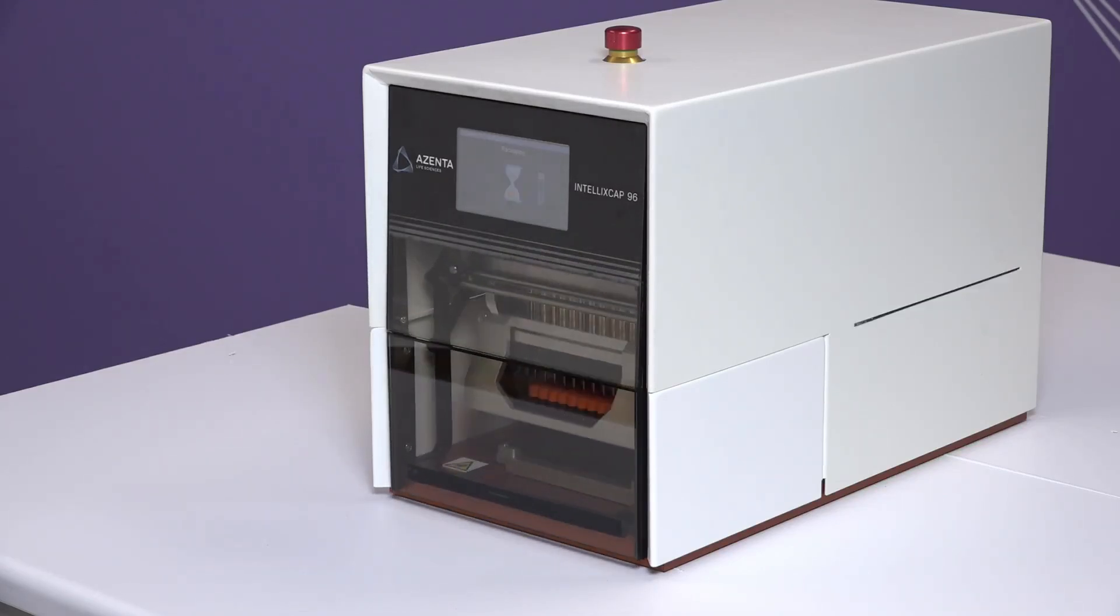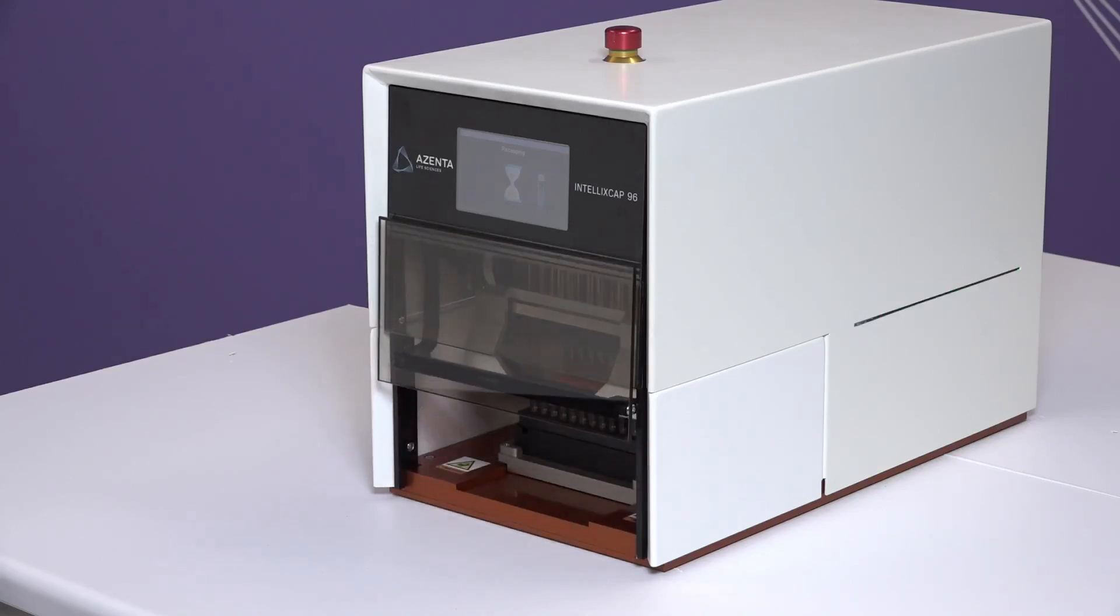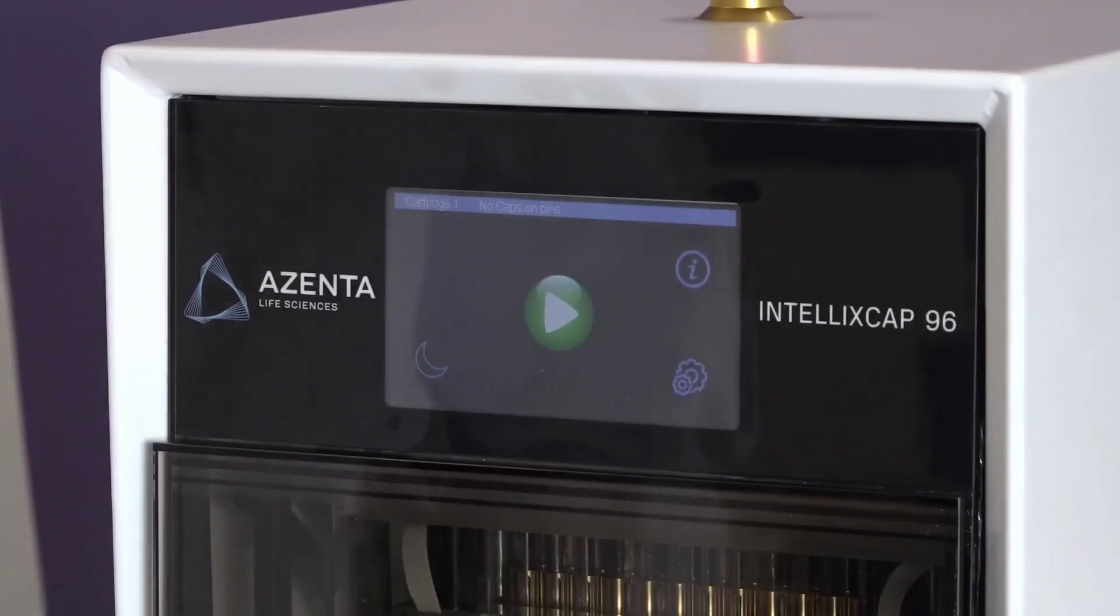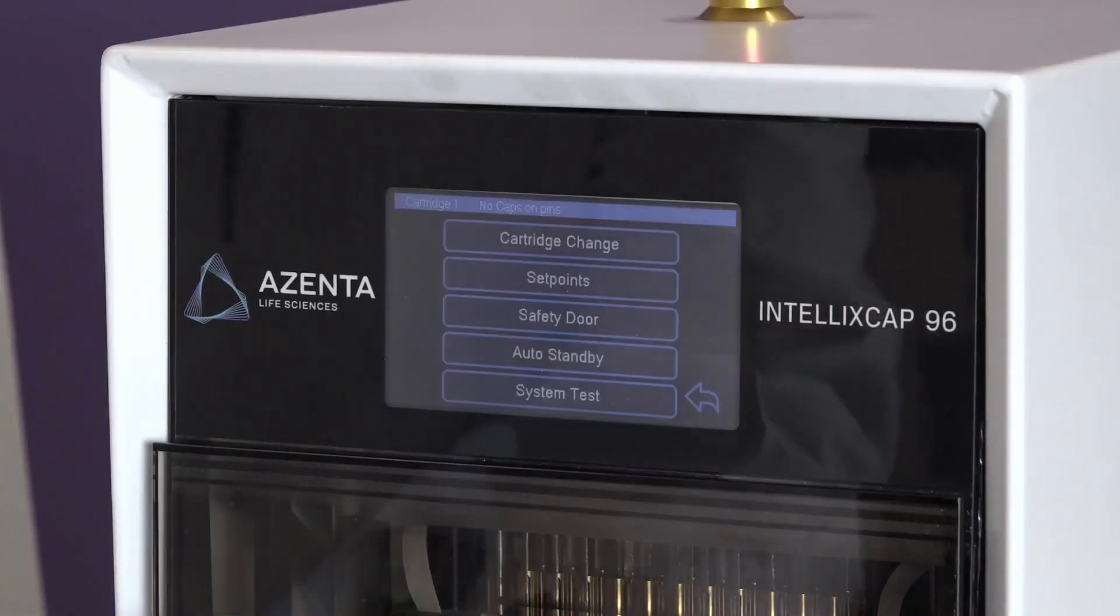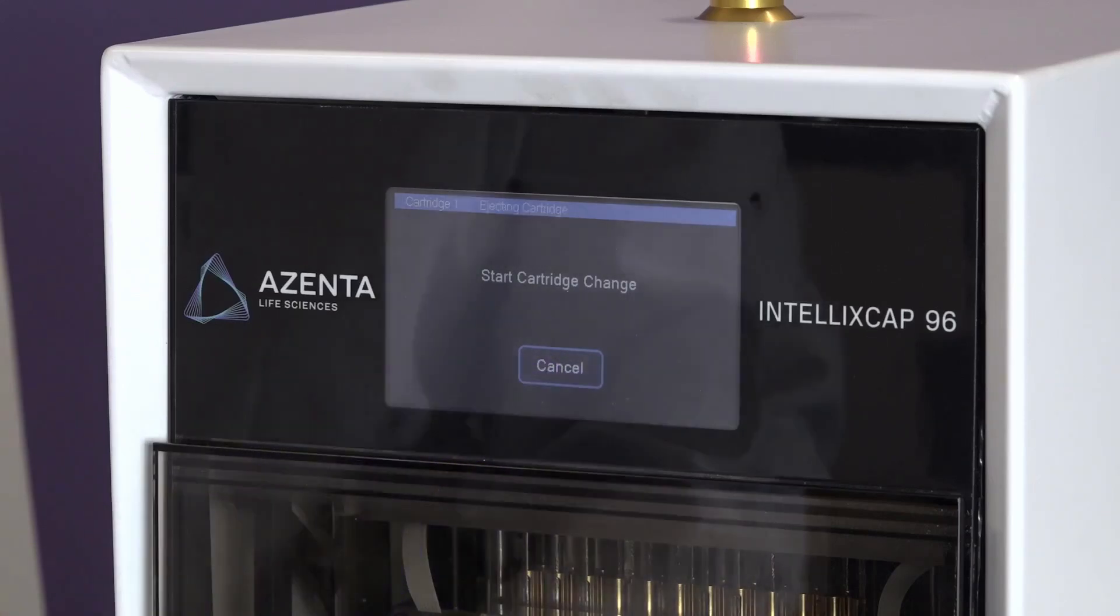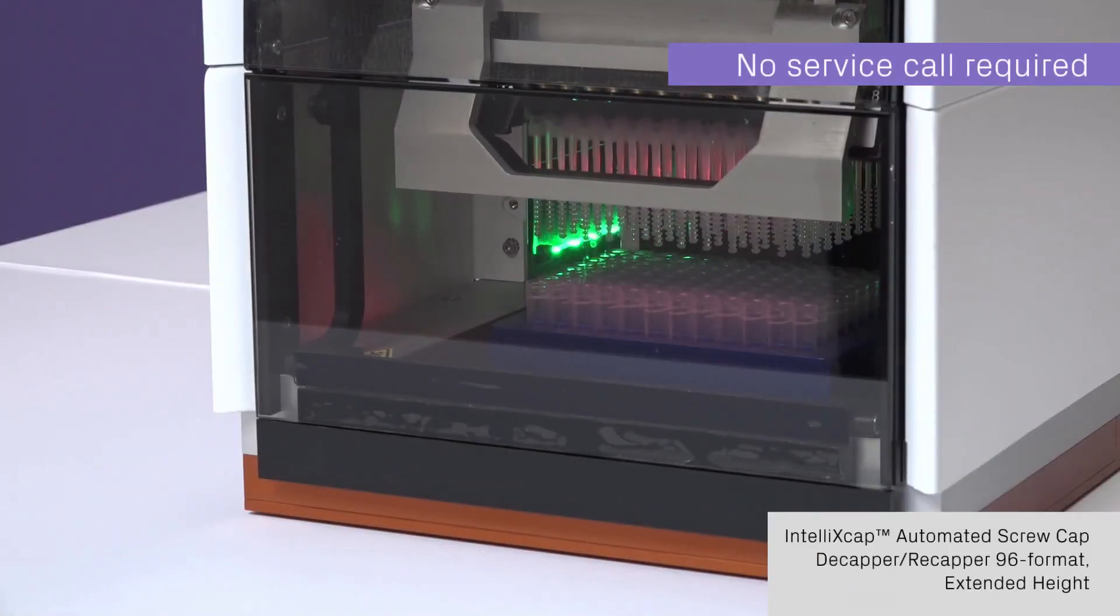With the right cartridge in place, the IntelliXcap can accommodate any automation-friendly Azenta sample tube in the compatible format, plus a wide variety of other tubes on the market. And switching between tube types couldn't be simpler. Using the touch panel, you can replace one cartridge with another in under two minutes, and it doesn't require a service call.